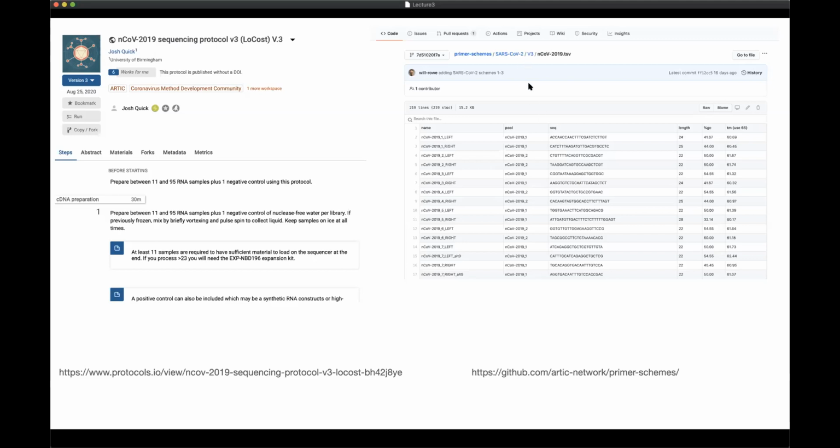So for instance, there you can look at their primers, and they're right here. You can see that left and right is forward and reverse, and here are the actual primers, the length, and TM is the melting temperature. So you will see that they are in the sweet spot that I mentioned a couple of slides ago, between 60 and 63 degrees Celsius.